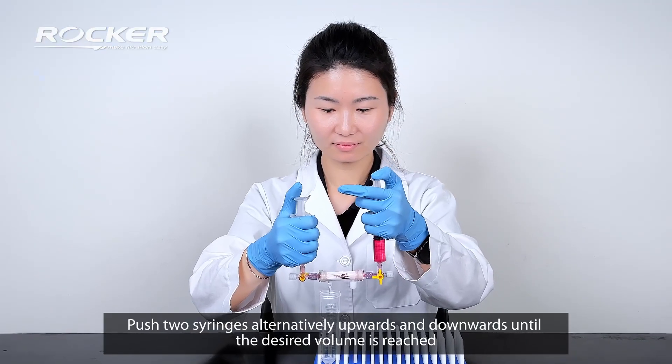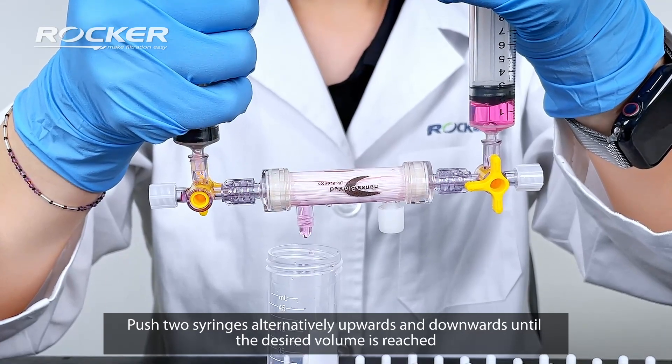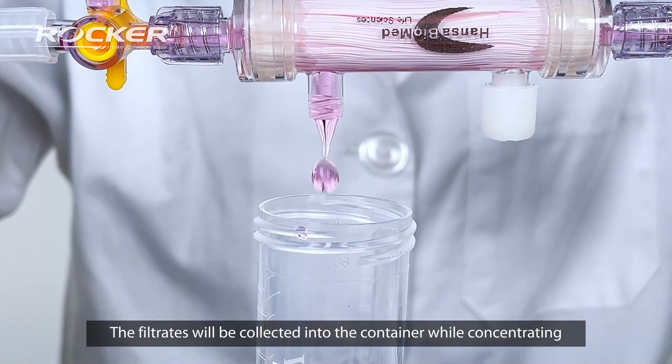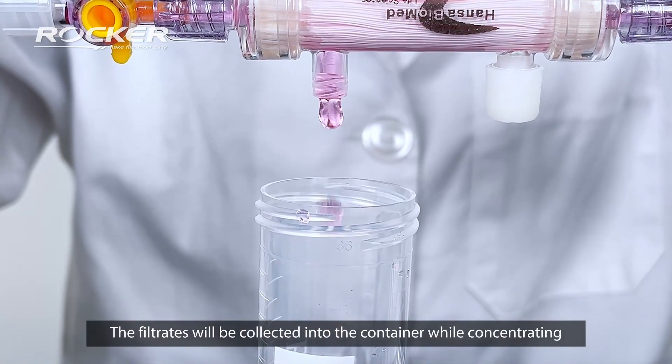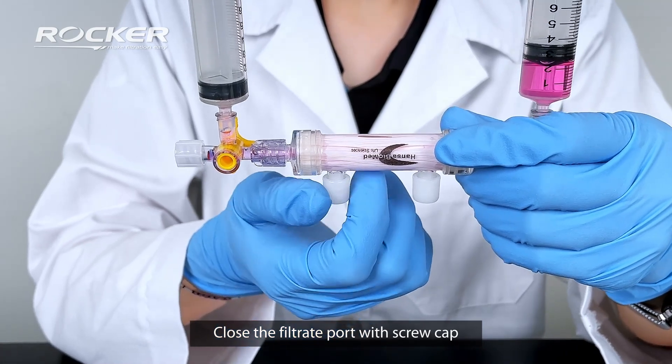Push two syringes alternatively upwards and downwards until the desired volume is reached. The filtrates will be collected into the container while concentrating. Close the filtrate port with screw cap.